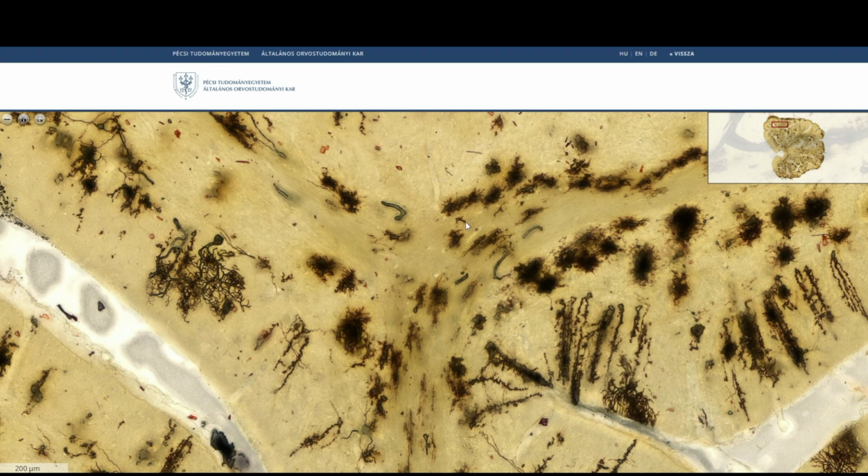So where you see again messy cells with not so clear contour, these are astrocytes, but in this case fibrous astrocytes. On the right side of this section, you see some Bergman glia cells extending to the whole molecular layer. The cell body corresponds to the Purkinje cell layer, and the processes are found in the molecular layer.